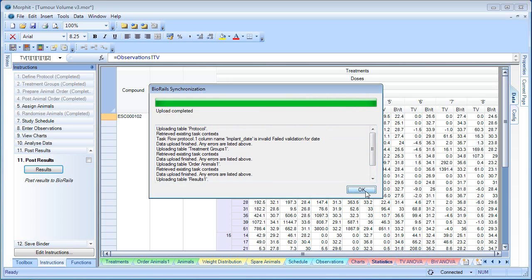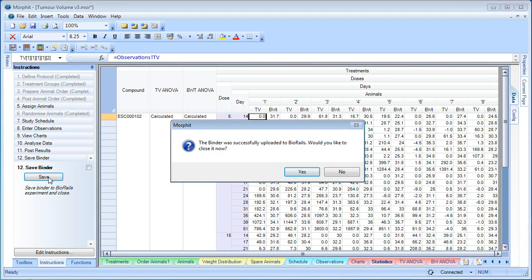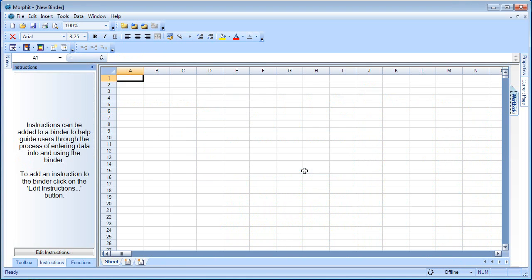The results have been uploaded. We have the option as well of saving this binder into the experiment. This will update the original version of the binder that we downloaded before we started the experiment. We can do this any number of times. Of course, we can work with the Morphid binder offline. The binder has been uploaded. We can now close it because we don't need a local copy.